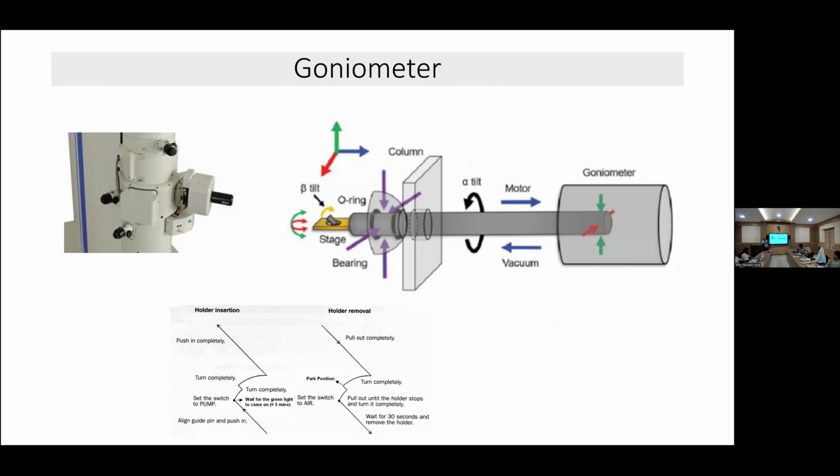This glove box, how it works. If you want to process or do something in some special atmosphere, like battery assembling, or if you want to handle lithium, then we use this glove box. So how can we insert things like our tools and materials, how do we take them inside, because there is a special atmosphere?